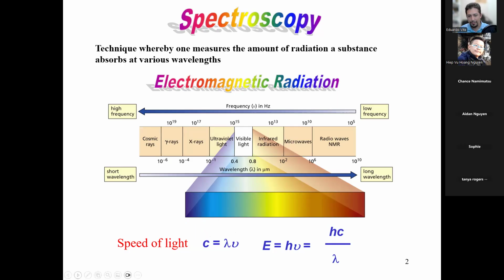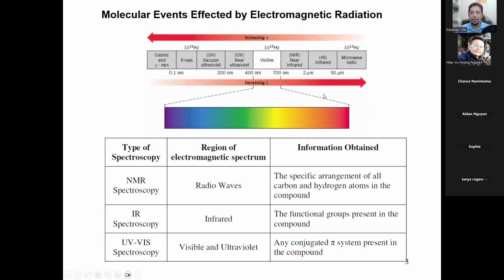Okay, so moving on to the next slide. Like I said, a photon of visible light can interact, for example, with my shirt or with your nails or with your eyes. And depending on how it gets absorbed and reflected and refracted, you can see different colors. The same thing happens when we shoot different wavelengths at atoms and matter. Sometimes it goes right through. Sometimes it's the same size as the atom or the bond, and sometimes it just vibrates or moves the molecule.